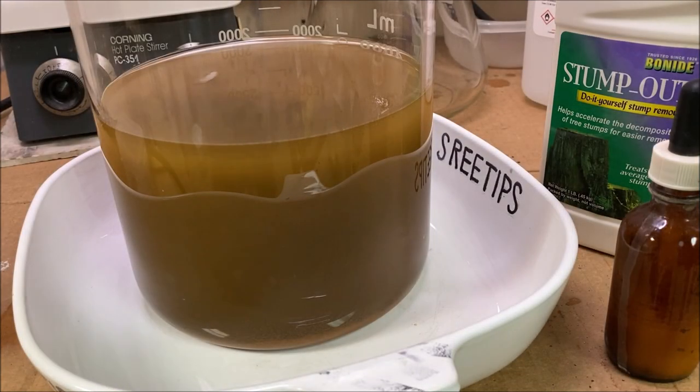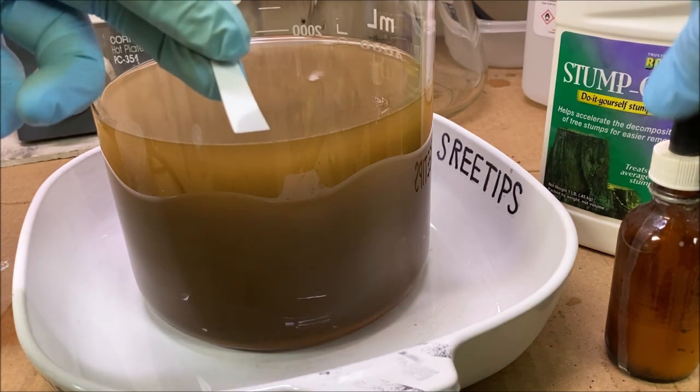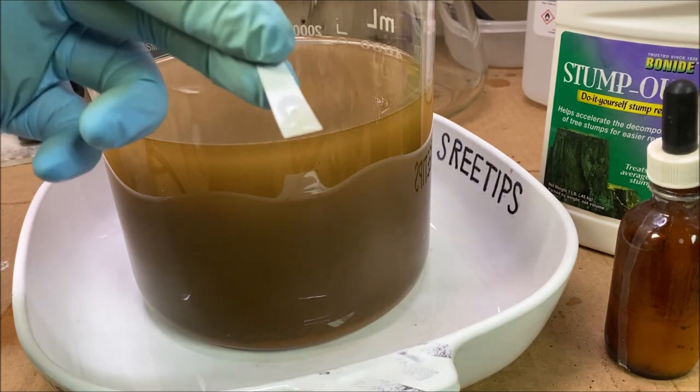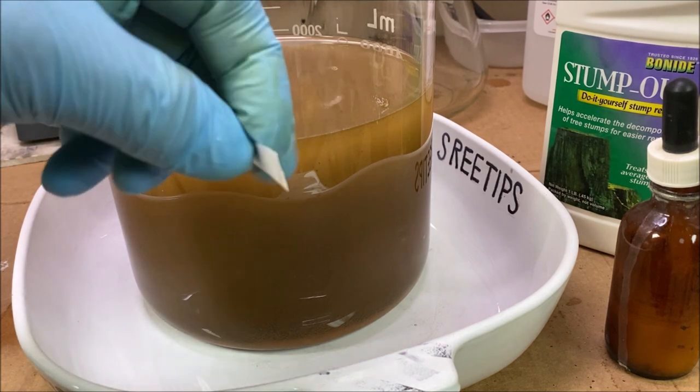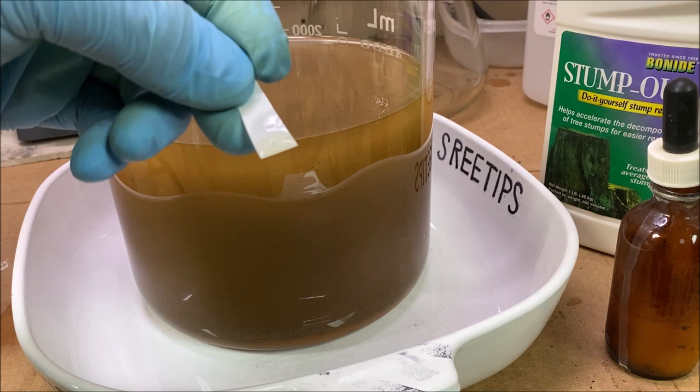I think we've got everything precipitated. I'll put a little bit of our solution on a piece of filter paper and put some stannous chloride on here. And you can tell by that negative reaction that every single bit of the gold has now been precipitated.